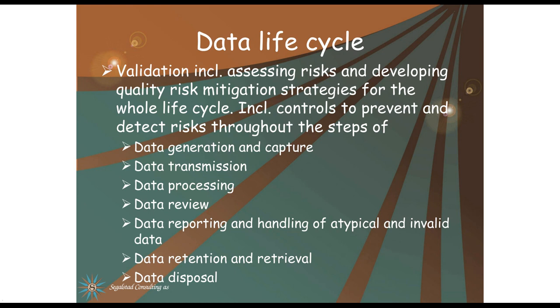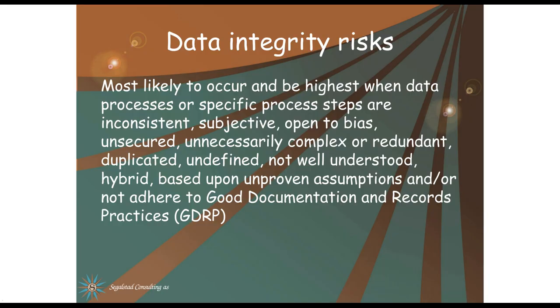Here we also need SOPs to state who, when, why, and how data shall be reviewed. Then, data reporting and handling of atypical and invalid data, data retention and retrieval, and data disposal. We need to think about all of this because this is the whole data lifecycle.